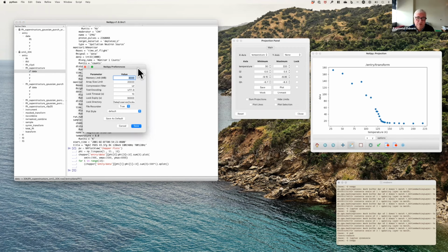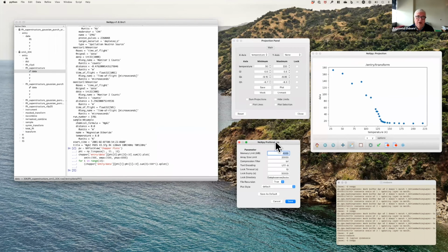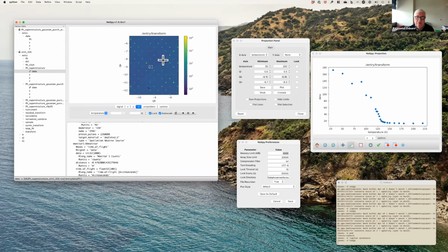But obviously, if you loaded a few of them, then you might be pushing things up. But you can get away with it. We only ever plot usually some two-dimensional slab out of that data set. So even though this might represent 10 gigabytes of data uncompressed, say, in memory all we have is the two-dimensional slab. The rest is stored in the file. I said you could create data entirely in memory. If you actually initialized a very large NumPy array and added that to an in-memory tree, then it would create a core memory file. But it probably wouldn't take very much memory until you actually started filling the slabs.